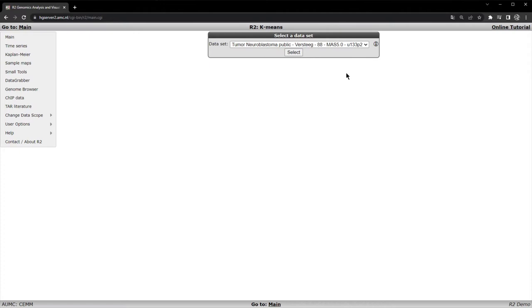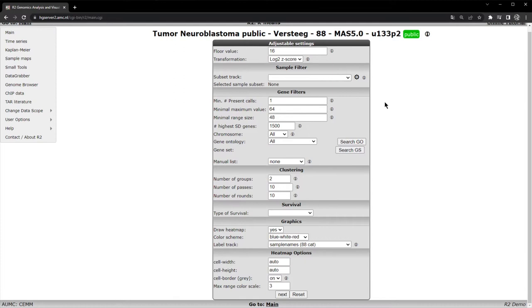The correct dataset is already selected for us, so we can simply click select. You are then presented with the adjustable settings in order to run the k-means analysis. In simple terms, k-means clustering is a clustering algorithm that is used to subdivide a dataset into a predefined number of groups.